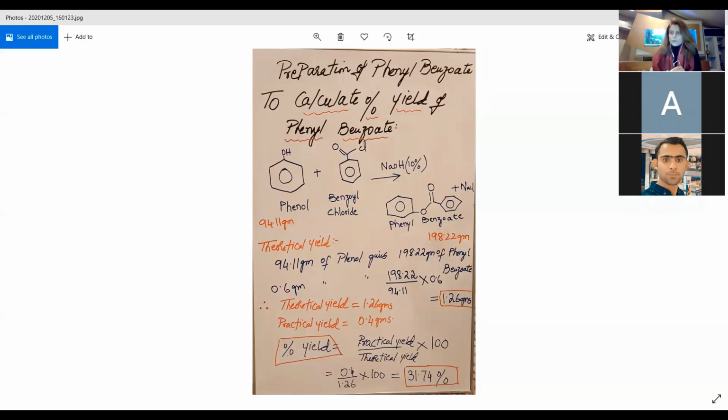If they are not forming and you have waited 5 to 10 minutes, maybe the question arises that the solvent level is a little bit higher, so you are now going to reduce the solvent on the flame. In the class demonstrations and lab demonstrations, I have told this again and again: you have to reduce the volume of the solvent when you do not get the precipitates in the synthesis, and even in the recrystallization, both.